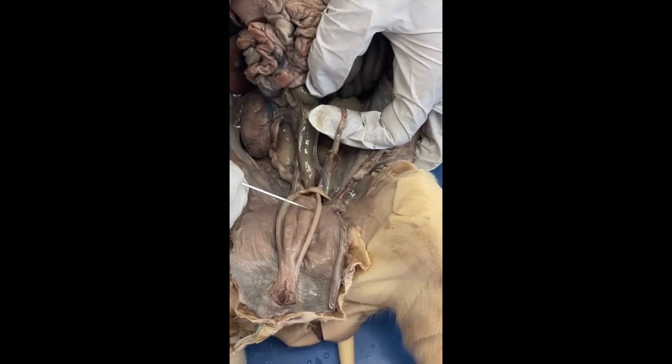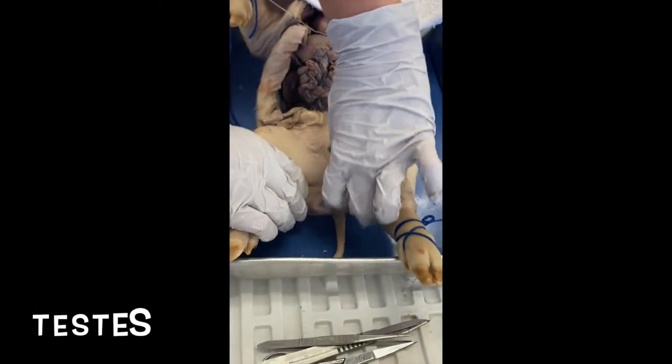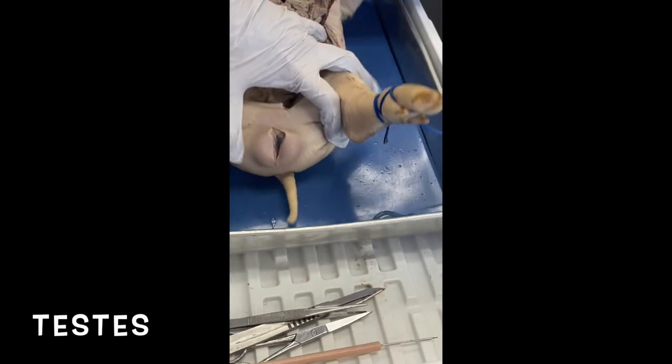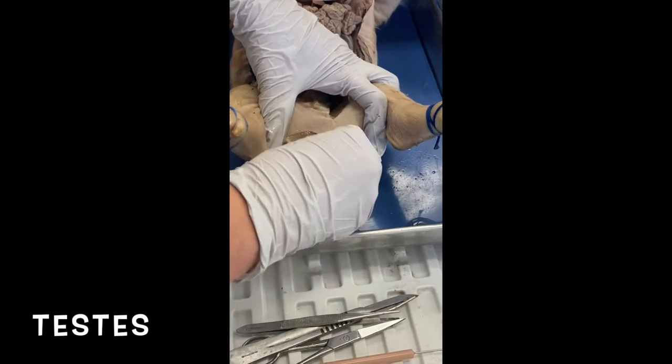Coming out here. Now, this is going to make some of you cringe. I just sliced the scrotum, and so we're going to pull out. I'm just going to peel this back.